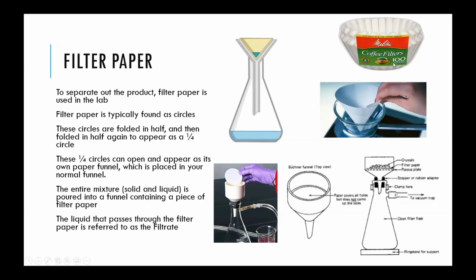It is literally just a piece of paper where you can pour a mixture of solid and liquid into it, and the filter paper keeps the solid up top, and the liquid, or filtrate, passes through the paper and pours out the other side.